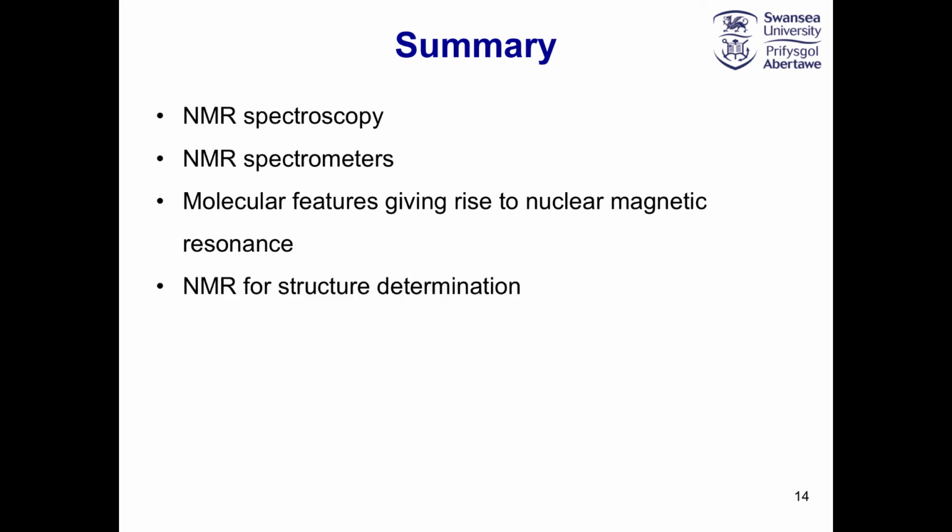The main use of NMR, as I showed you, is for determining structures of molecules by considering the number of resonances, their chemical shifts, their integrations, and their splitting patterns. Sometimes you may want to use IR or other techniques to resolve any ambiguities in the spectrum, but often a combination of hydrogen and carbon NMR will be enough to solve the structure of a small organic molecule. NMR also has lots of other uses that I haven't considered here, but that's a story for another year.